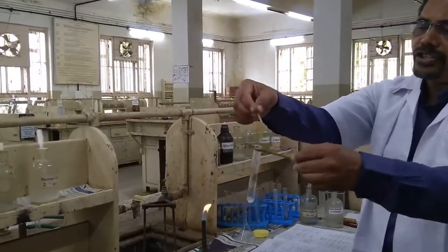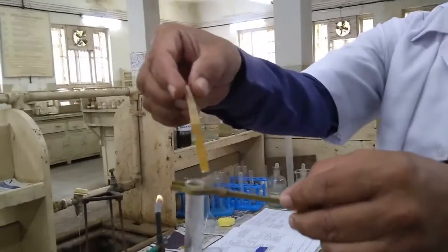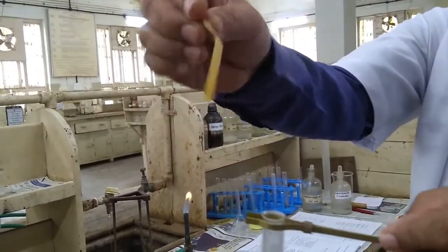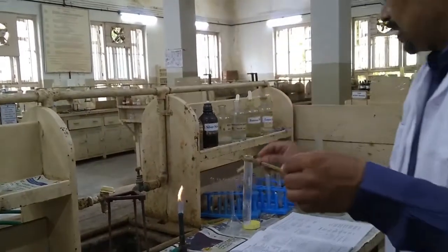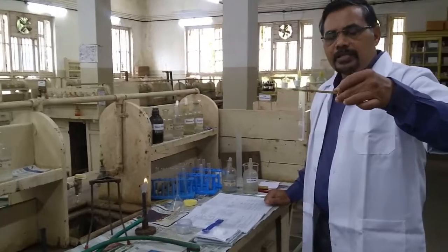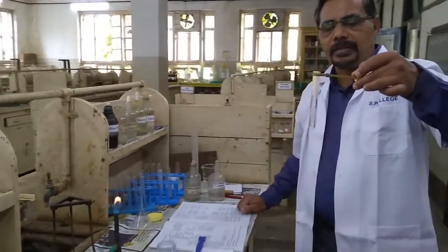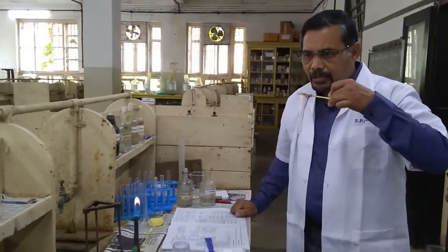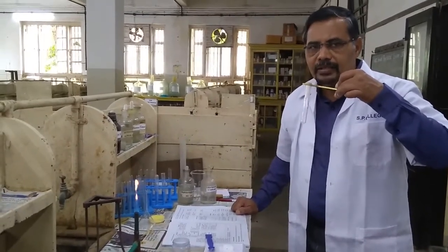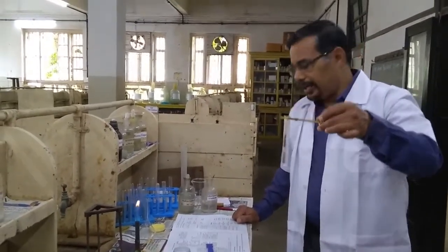So this turmeric paper becomes reddish brown, and that indicates the presence of NH4 plus radical. See the color change while holding this paper. Turmeric paper becomes reddish brown. This indicates the presence of NH4 plus radical. We can also test this NH4 plus radical by taking the smell. So the smell of ammonia gas can be easily identified.